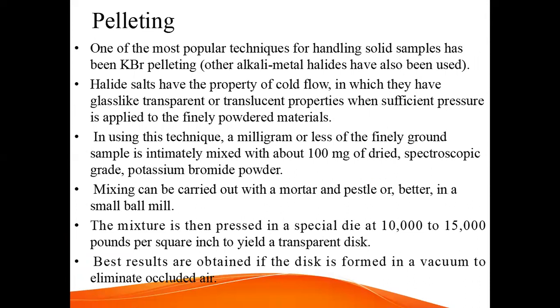In solid sample handling, different techniques are used. First one is the pelleting. One of the most popular techniques for handling solid samples has been KBr pelleting. Other alkali metal halides have also been used. Halide salts have the property of cold flow, in which they have glass-like transparent or translucent properties when sufficient pressure is applied to the finely powdered materials.